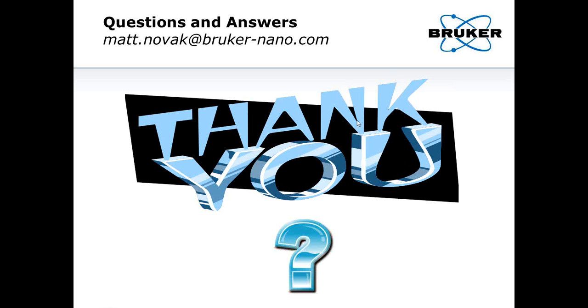Okay, so the first question, someone asks, how does the lateral resolution compare between the systems? So the lateral resolution in any microscope system is fundamentally, you know, you can call it out a few different ways. Some people will call it out by the Sparrow criteria. Some people will call it out a little differently depending on what their needs are.